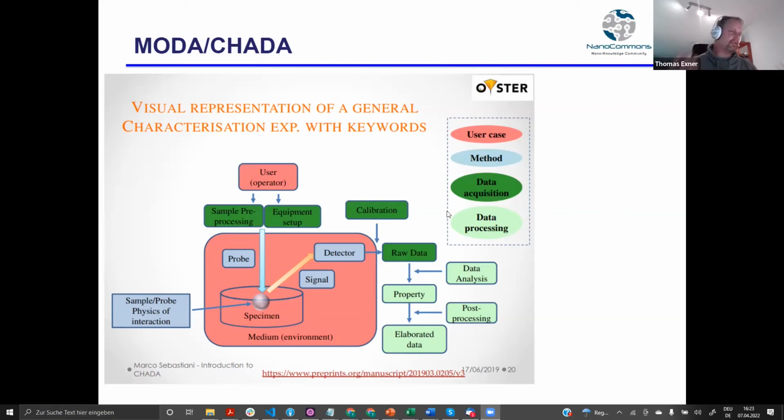That you really say, okay, you have two assays which are the same, and you have two different SOPs for something which is meant to do the same. Are they actually different or not? Therefore I see again this need for structuring and putting that into pieces.